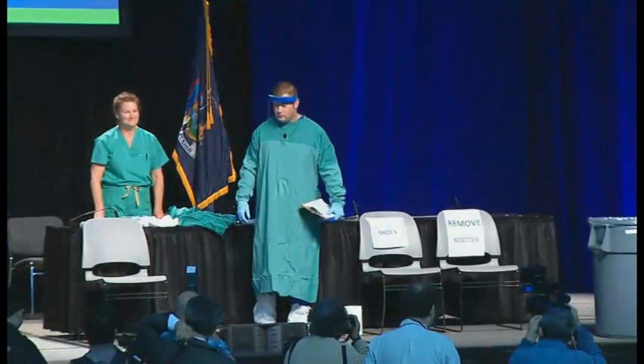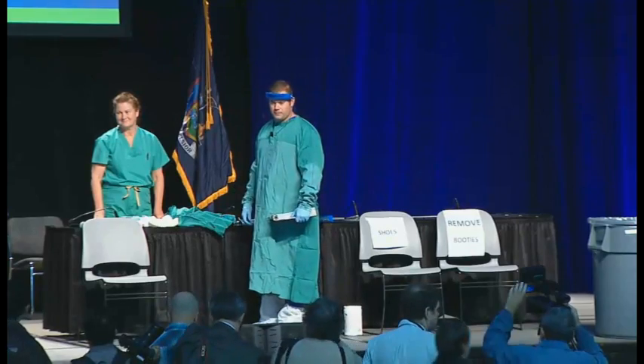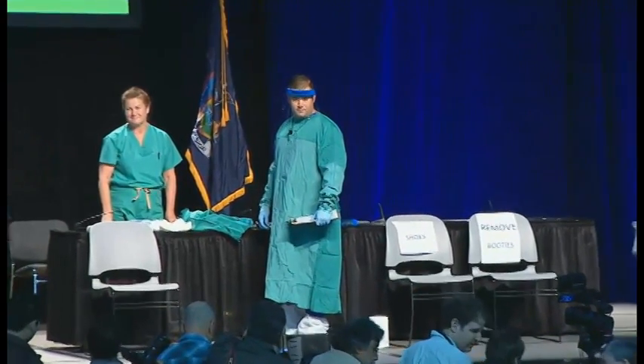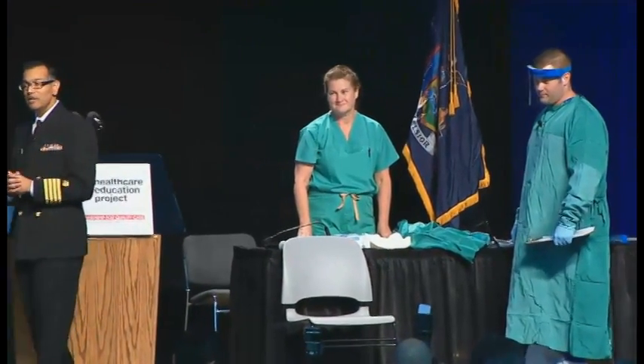As you can see, one of the important principles we're emphasizing here is that this takes a little time. You don't just come up with the box and start putting things on. Brian and Barbara are going to walk us through this procedure. What they did first was to come up, check out everything, lay out everything they needed.